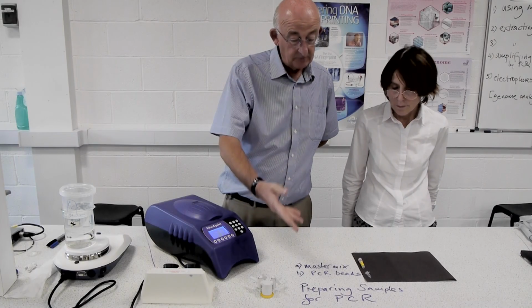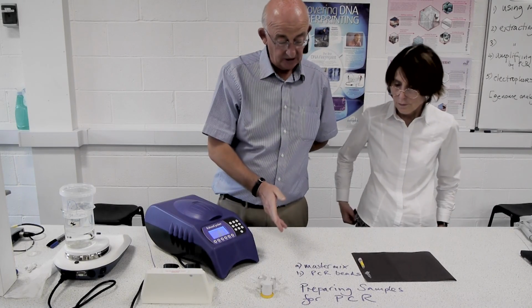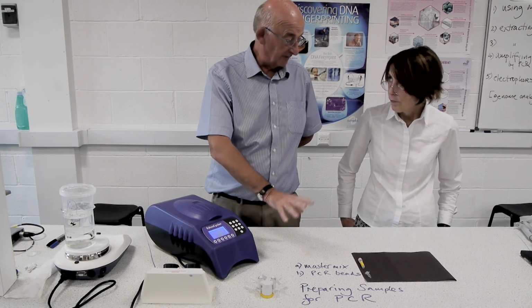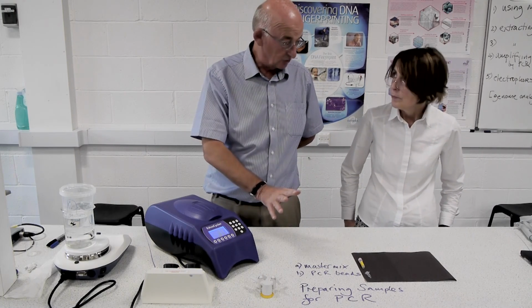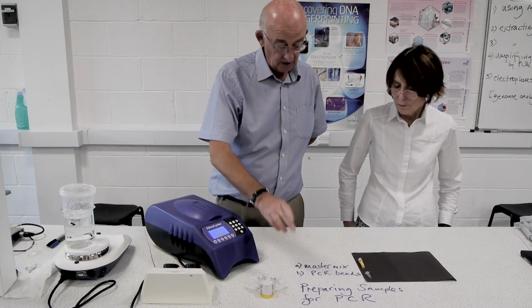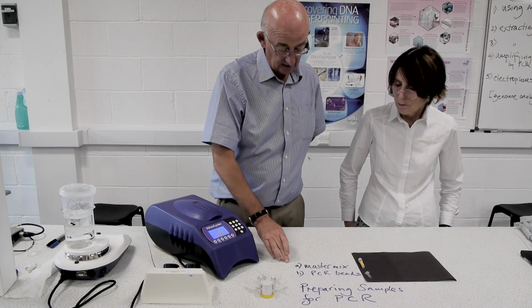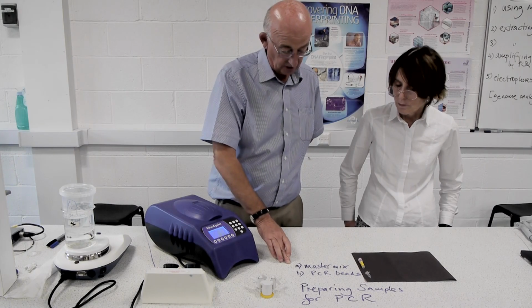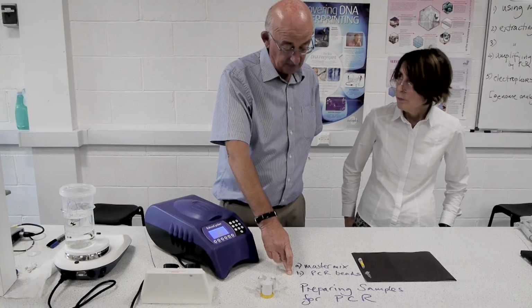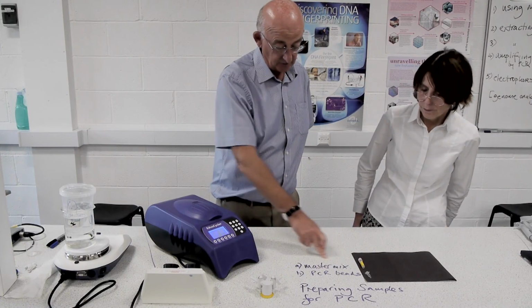Right, we're still preparing our samples for PCR. Having extracted our DNA, we've got that ready, haven't we, in the correct PCR tubes. We now need to make sure that we add either a master mix formulation or a PCR bead method. Now Mary can explain to you the difference between those.